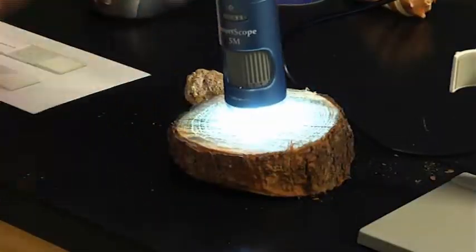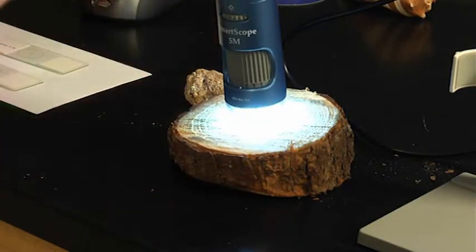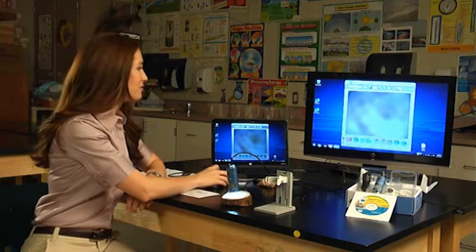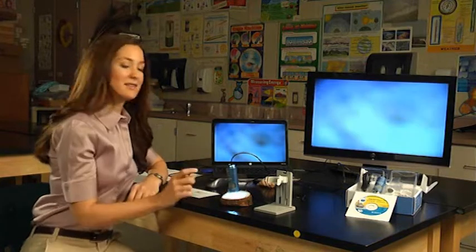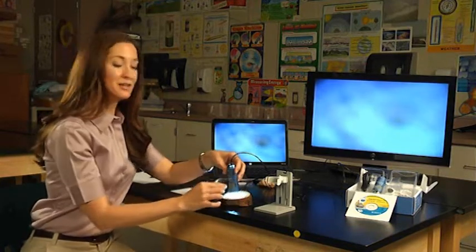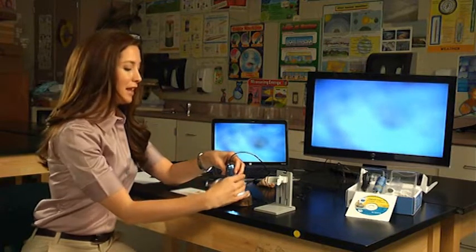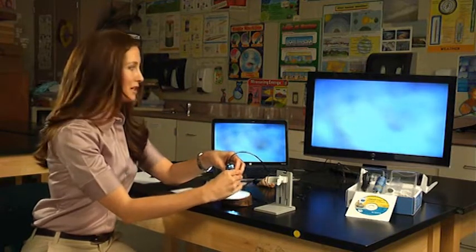You can analyze things with the SmartScope 5M that you would never be able to look at with a regular microscope. I'm going to go back into full screen mode and take a look at this wood block. Again, you're going to want to make sure that your focus dial is turned all the way to the right. And my light's good. The dial right here in the middle.